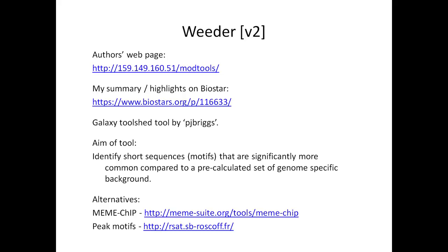Motifs are compared to the background expected values for each motif. Successful motifs are then scanned against the entire data set, and a frequency matrix is generated. Positional weight matrices, or PWMs, are then cleaned or filtered using the expectation maximization, or EM, algorithm.